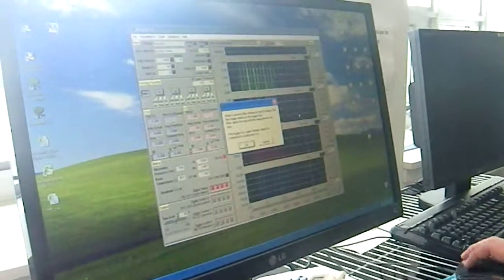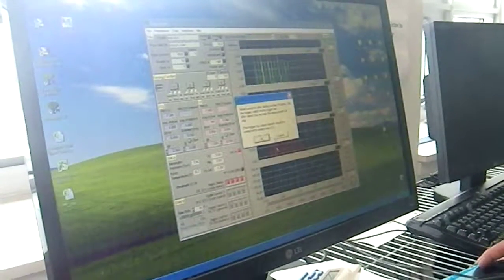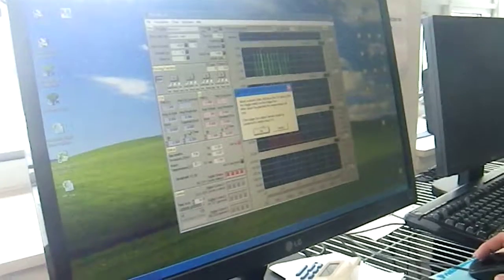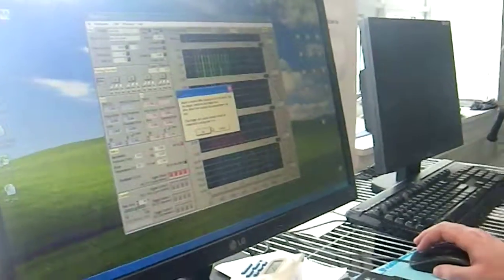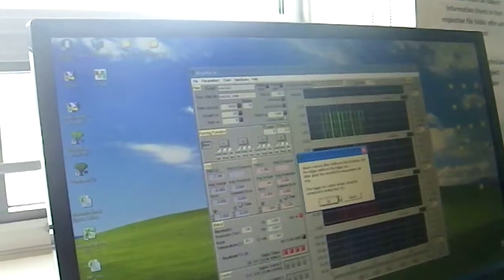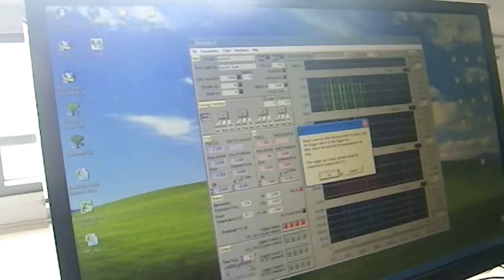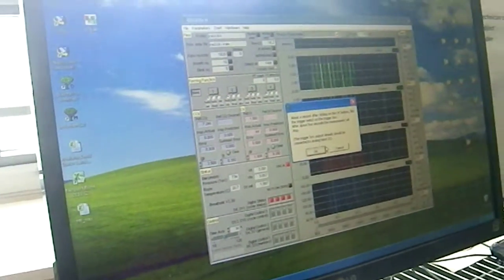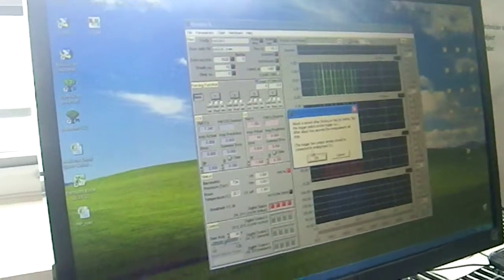That way you can calculate oxygen, CO2 consumption, and whatnot. So every time you do this, you'll have to click OK. It's going to get a baseline signal, and then you'll flick on the calibration gas switch so that it can see when it changes, and then it'll measure the delay between the electrical signal coming in when it's turned on to when it actually measures the gas.